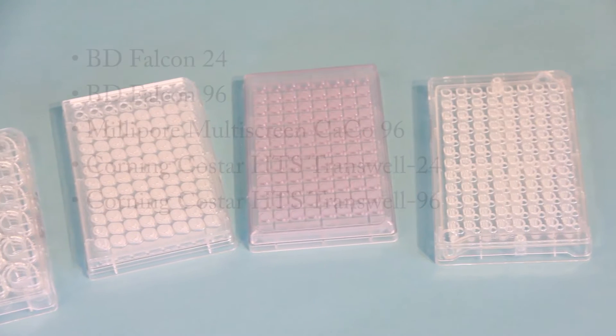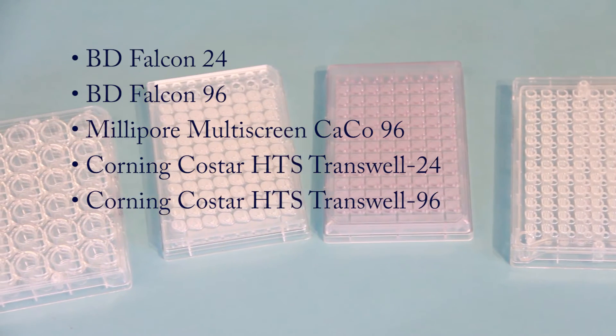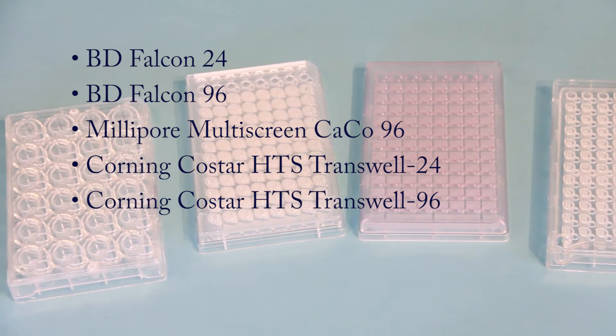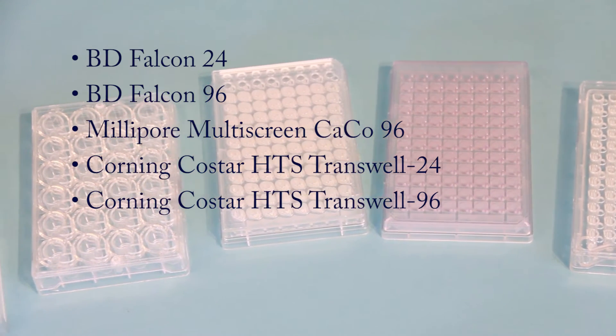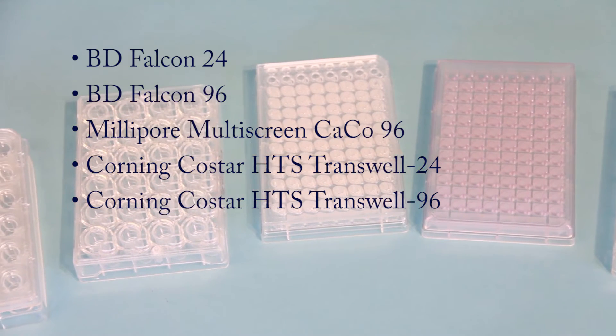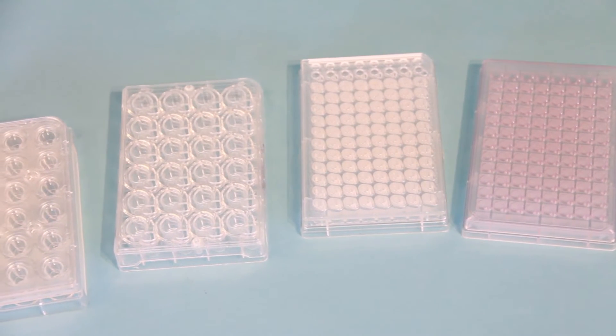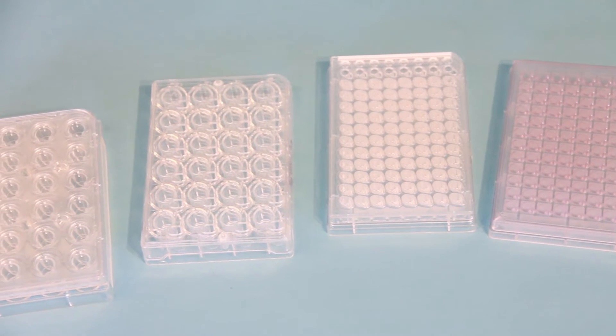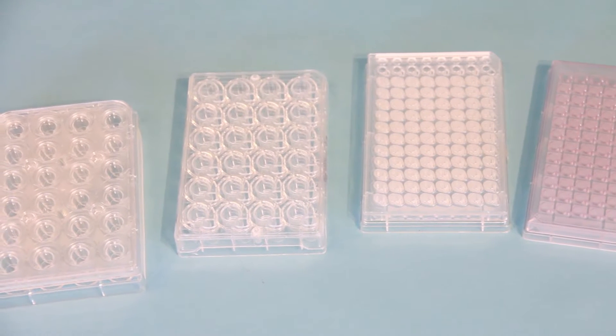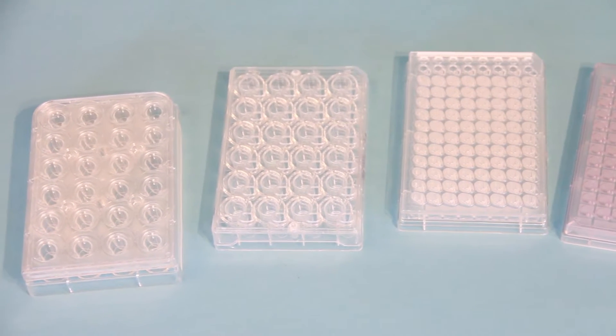WPI has designed REMS electrodes compatible with major manufacturers of HTS well plates such as Millipore, BD Falcon, and Corning CoStar. This makes it easy for researchers to choose an industry standard well plate that best suits their cell line.